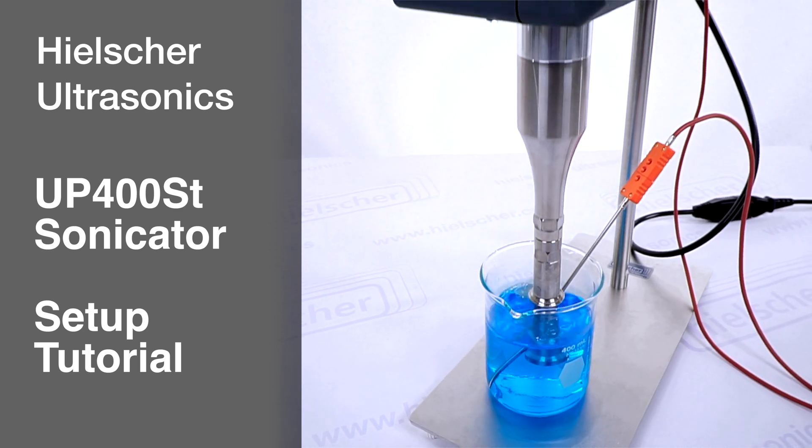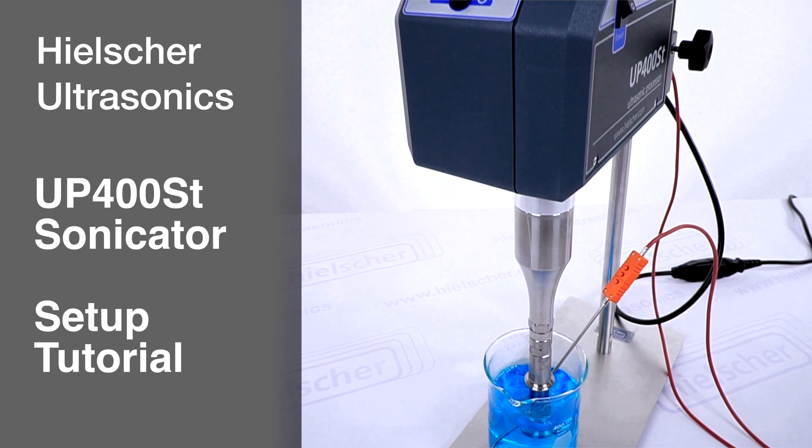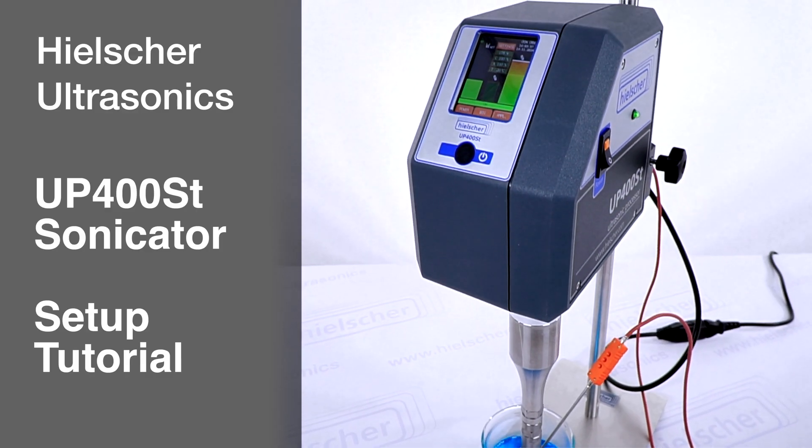In this video, we will guide you through the initial setup of your Hielscher Sonicator UP400ST.